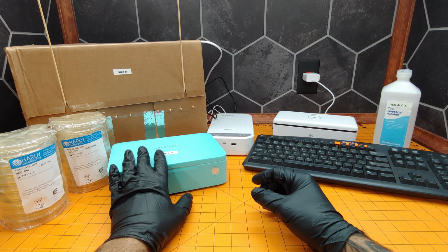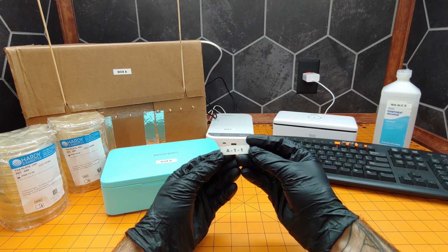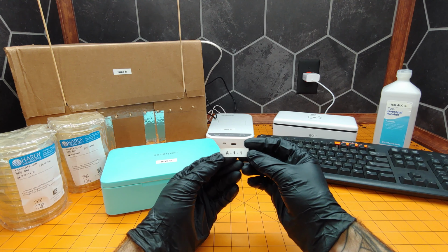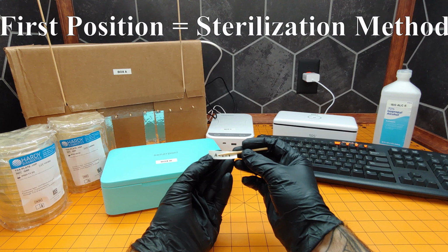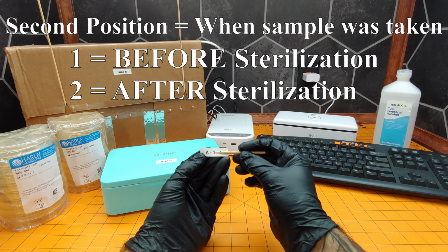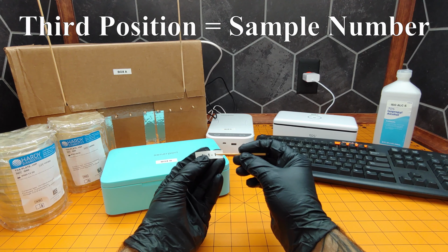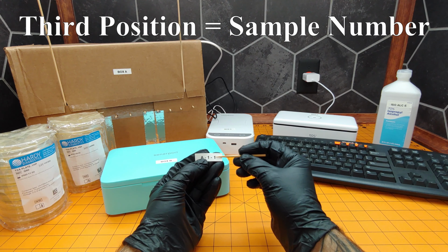Let's explain the experiment. First, each of our sterilization methods has been given a unique identifier: Box A, box B, etc. Next, we'll be using a 3-digit identifier on each of the dishes. The first digit represents which box or sterilization method was used on the dish. The second identifies which cycle it is, a 1 being before sterilization or a 2 for after sterilization. The third digit tells us which dish in the series it is. In this case, it will be either a 1 or a 2.